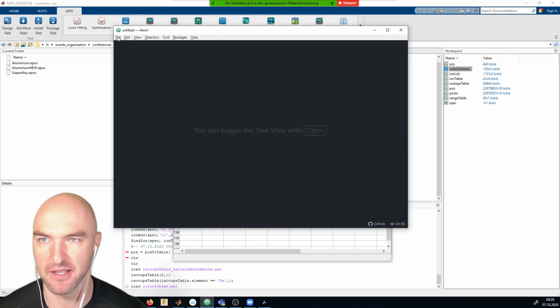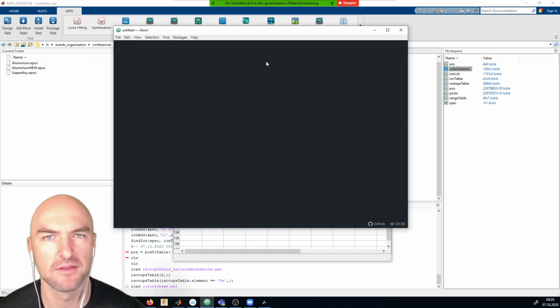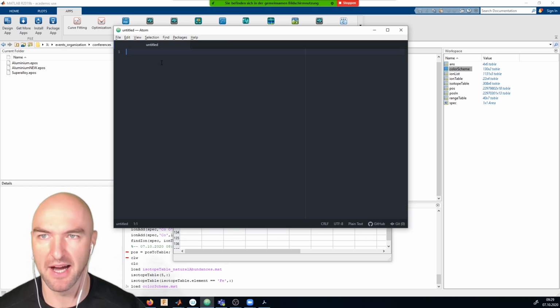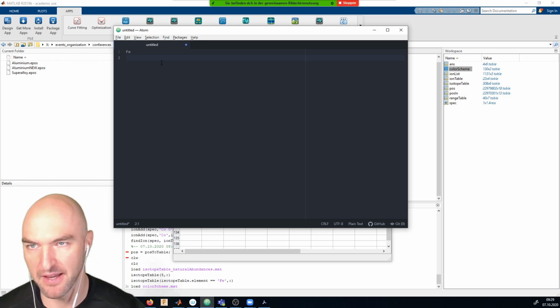I think it's relatively straightforward. So essentially, if you have an ion, then you have various ways to write that ion, and this will be very consistent throughout our toolbox. Basically, if you have an element, you just write the element as is. Yeah? If you have a complex ion, if you have a molecule, then you put a space between them.